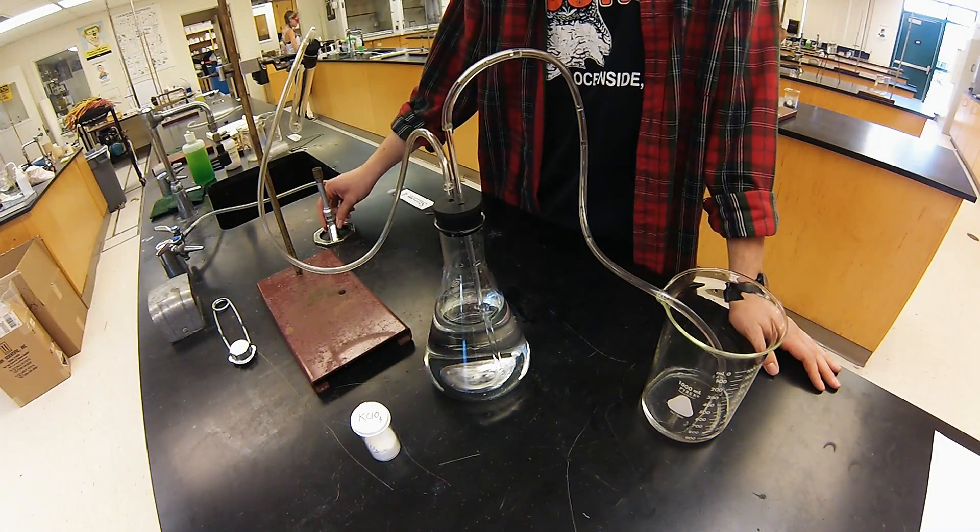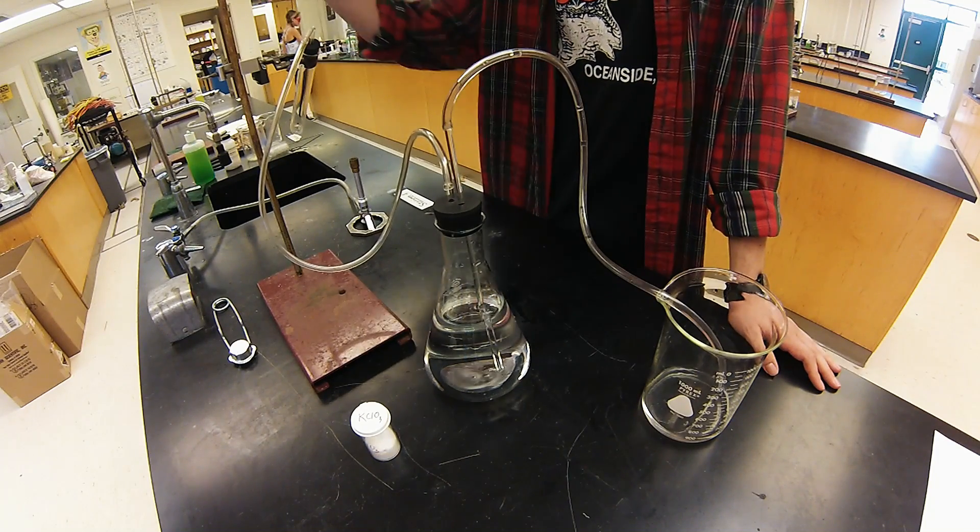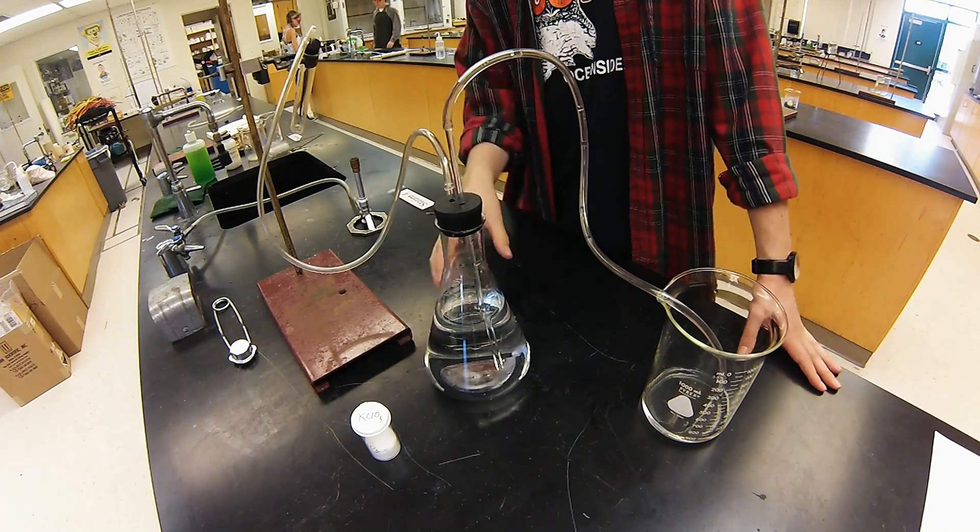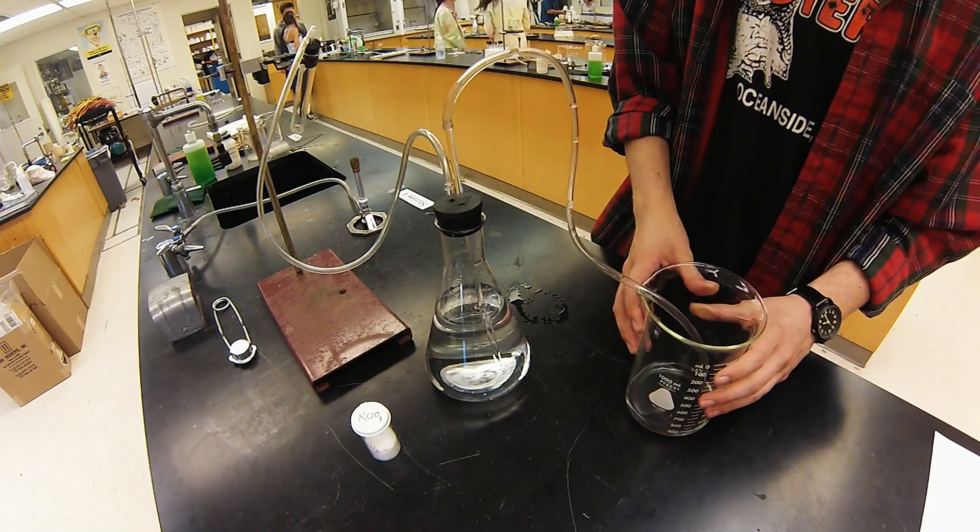For this lab we're going to need a Bunsen burner, a large test tube, an iron ring stand, and a thousand milliliter Erlenmeyer flask and beaker to go along with it.